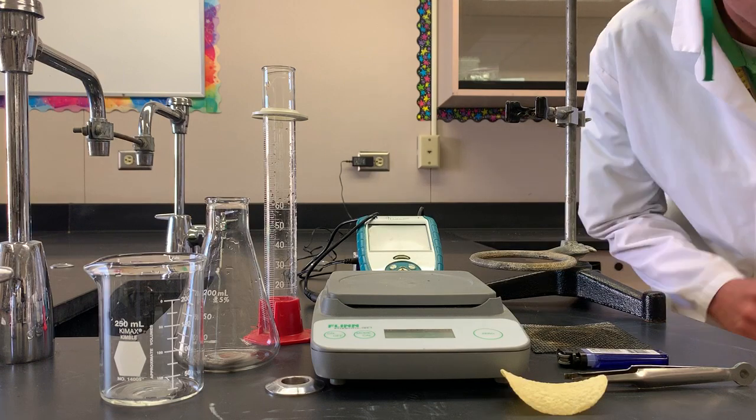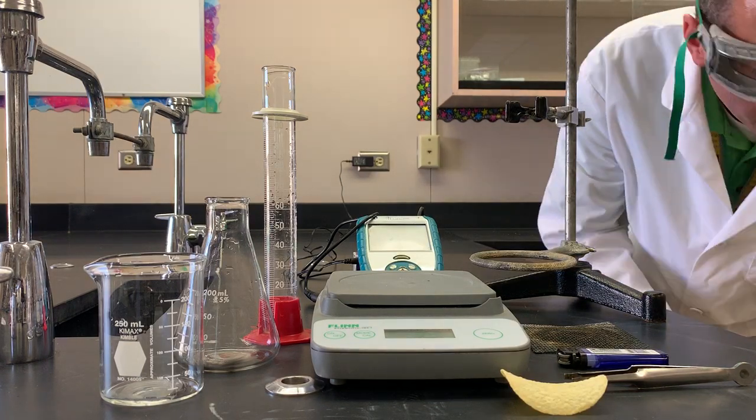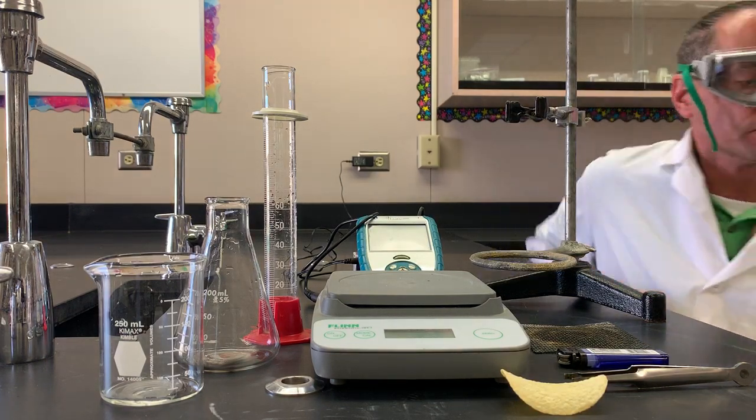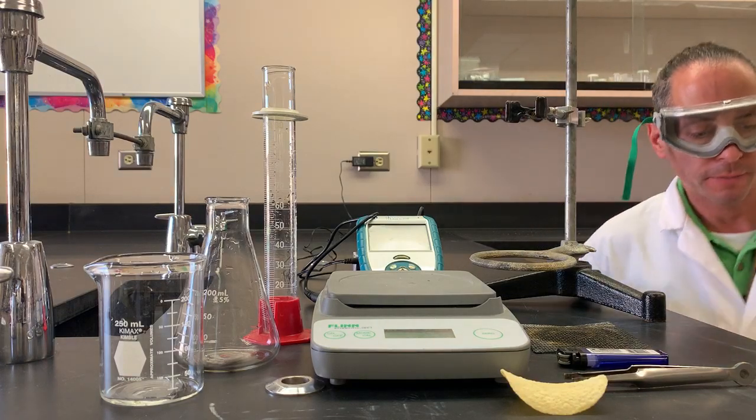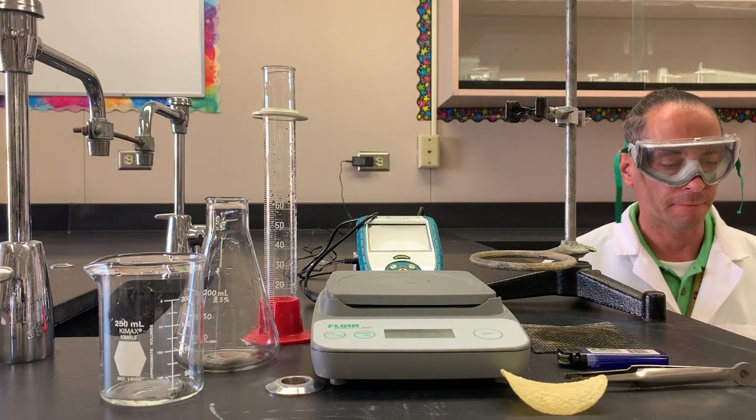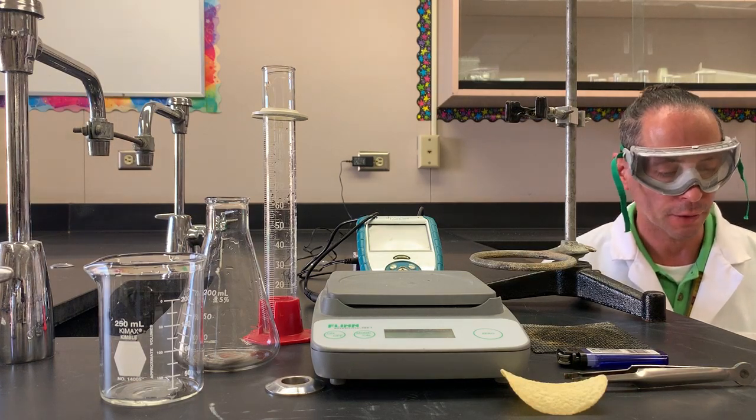We're going to be looking at this food calorimetry quick lab — how much energy is in this chip. The objective for the lab is to conduct the calorimetry experiment to analyze the energy content of food, that food being a Pringle crisp.